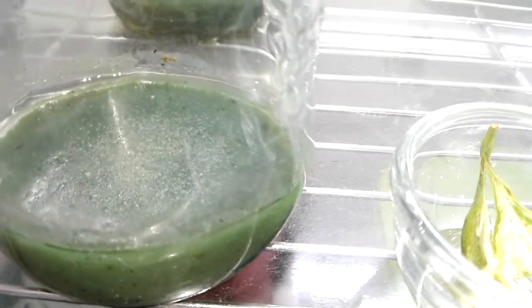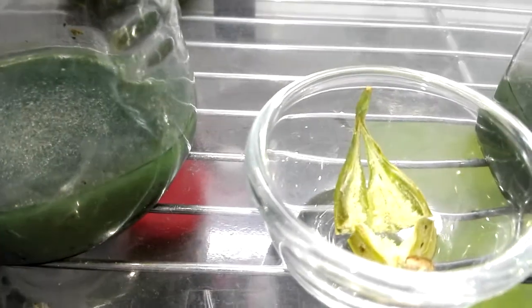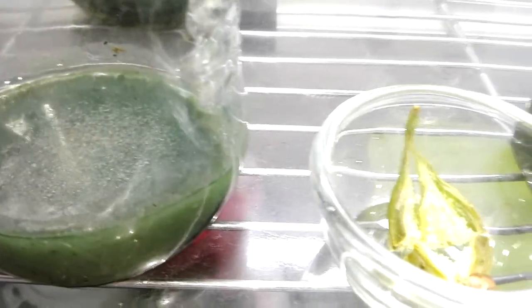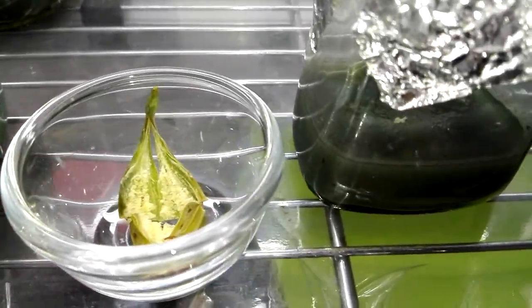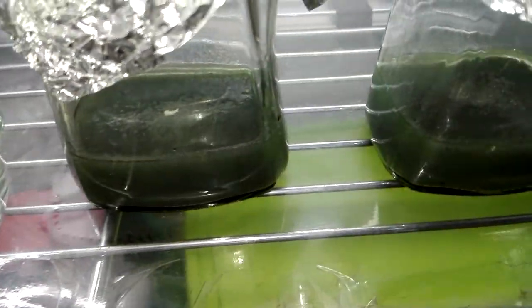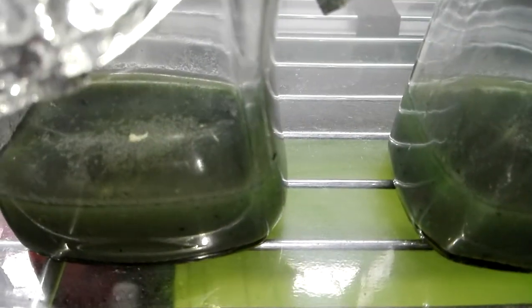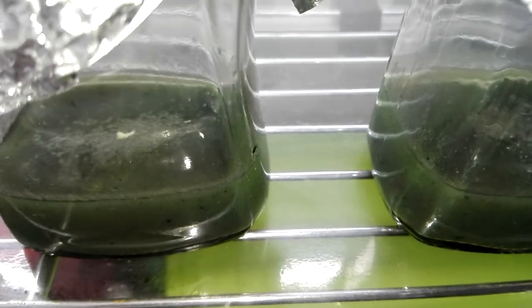In about two to three weeks' time, I will be expecting growth inside my flask if I'm going to be successful. Since my first attempt was a failure, I hope this second attempt will be a success for me.